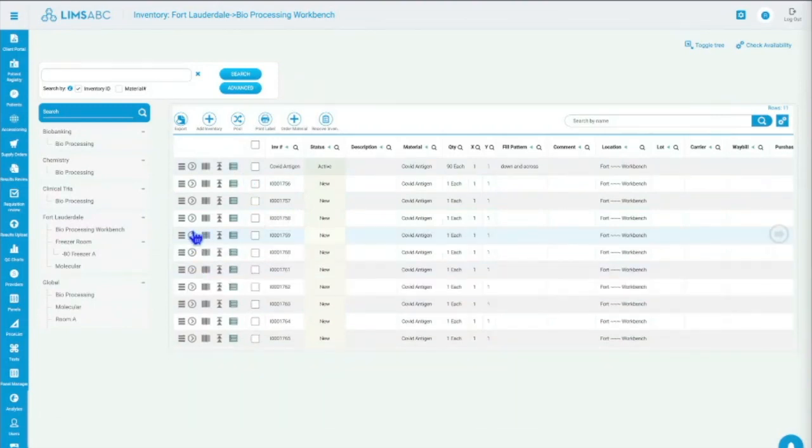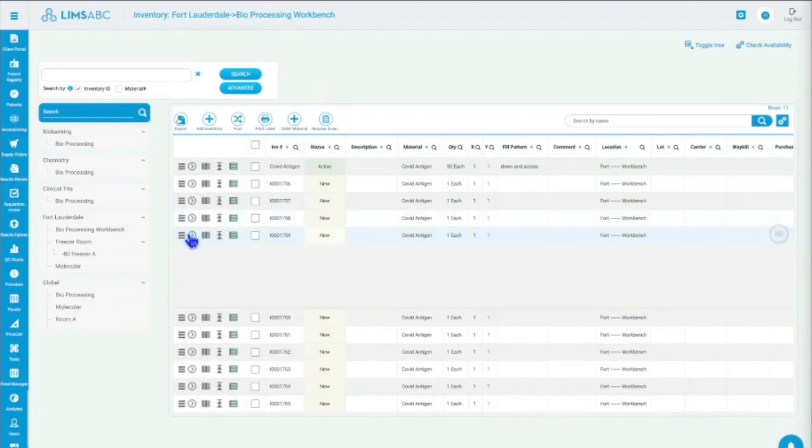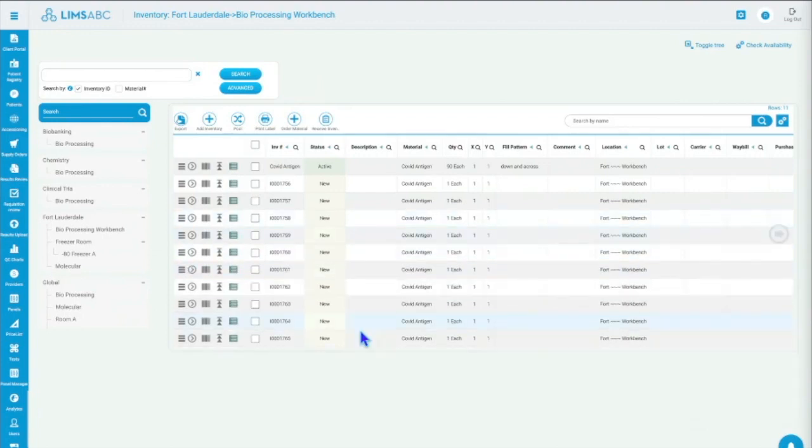That's kind of it. As for the components here, if you have a kit, you can actually manage kits where you have inventories within inventories, right? So you have a kit with 5 tubes, and so on. We can track that as well, to say this particular kit has this. We used to use this a lot with other systems that we have for clinical trials, where you track more the kits and the tubes inside the kit, and you receive them. You need to be very granular there. They're in the clinical trial space.